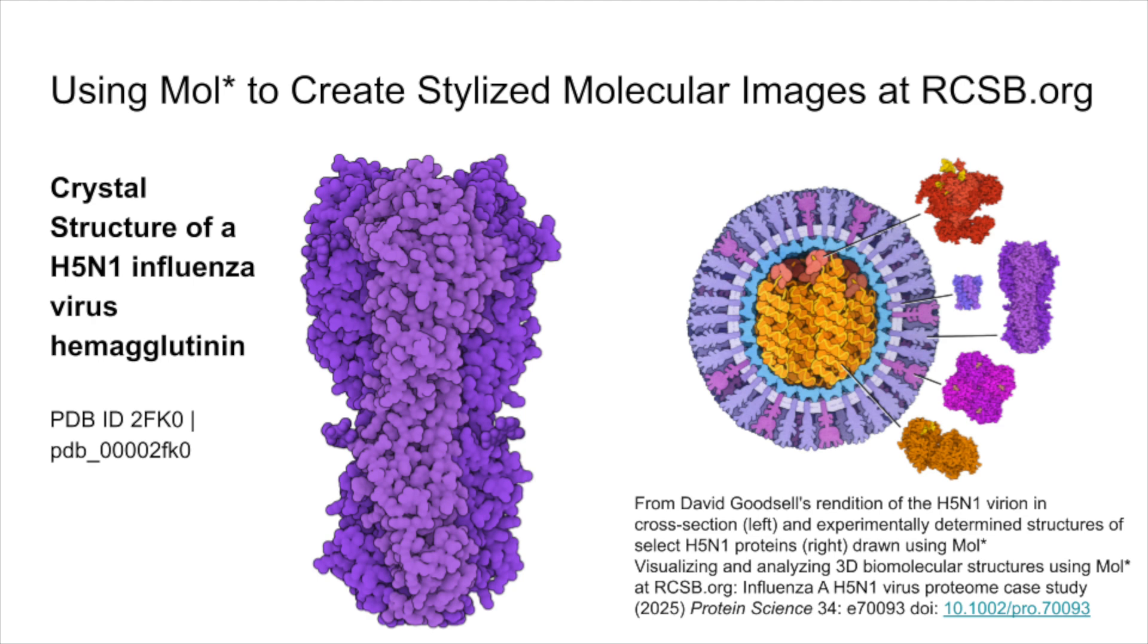Welcome! In this tutorial, we'll walk through how to create stylized, illustrative renderings of molecular structures using MolStar, an open-source 3D molecular viewer.